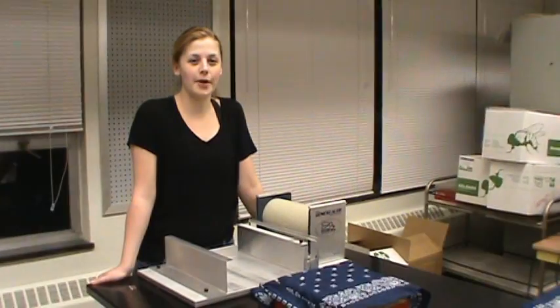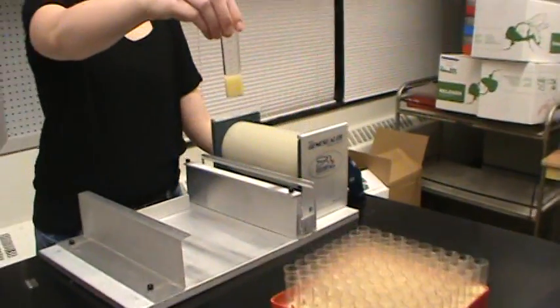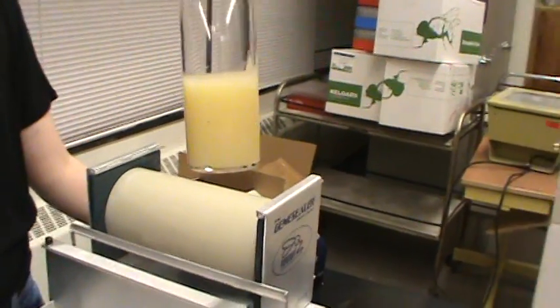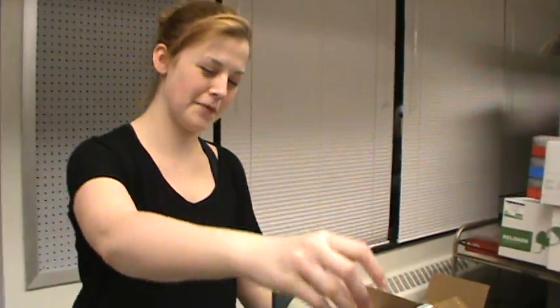Now it's been about four hours and the food is solidified. So to prevent further evaporation, we're going to seal it with the Gene Sealer.